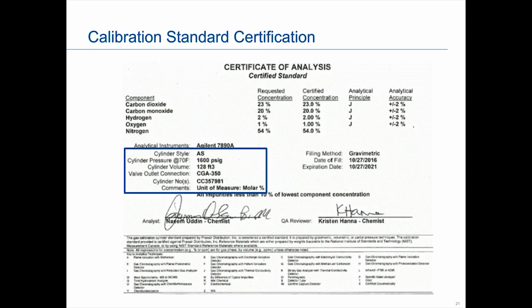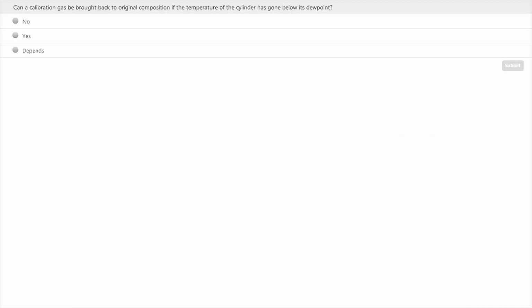Okay, good. The answer is yes. You actually can store it in the GC. Basically, you would go where the parameter sheet is, click on it, and then you have the chance to upload it. As long as it's a PDF, Word, or Excel file, you can definitely upload it. And that works for our XA series, so that's the 370 XA, the 700 XA, and the 1500 XA.